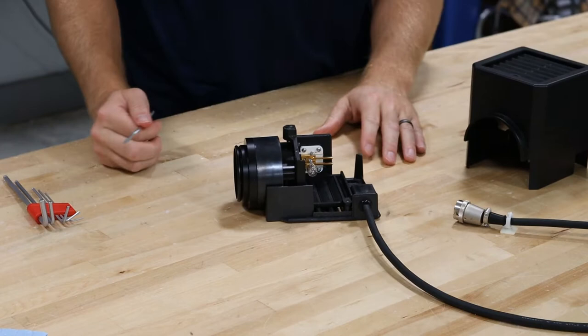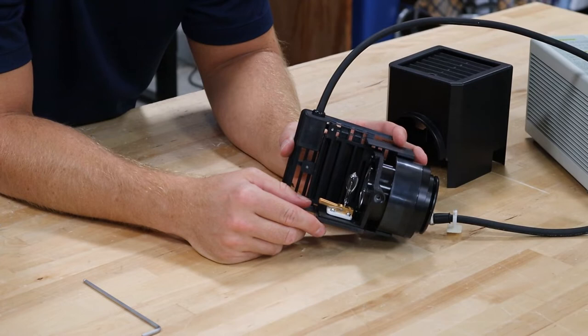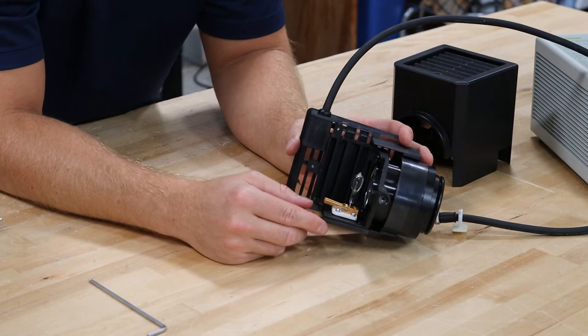Once this cover's off, you've got a 12-volt, 100-watt lamp bulb here. It's an Osram bulb in this particular model. You're going to want to use a box of chem wipes, a glove, so forth, so on.